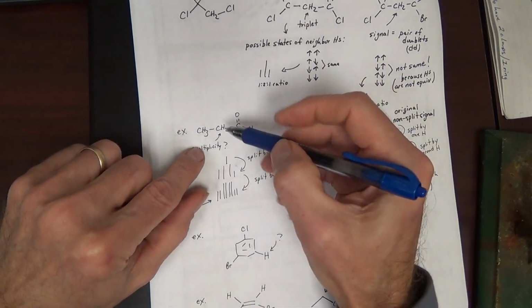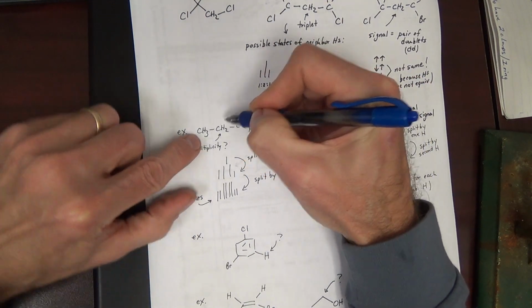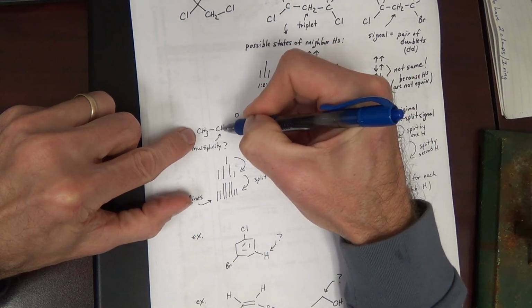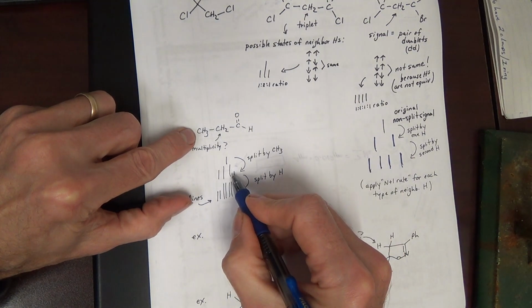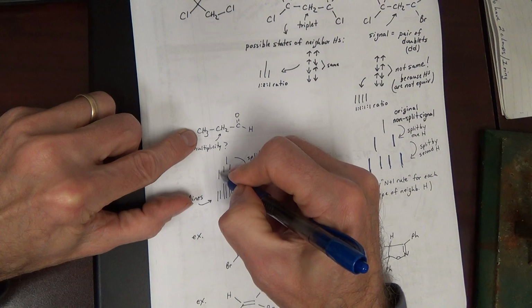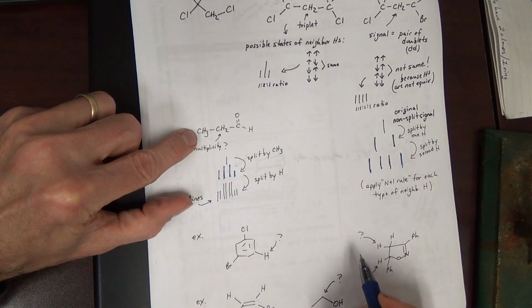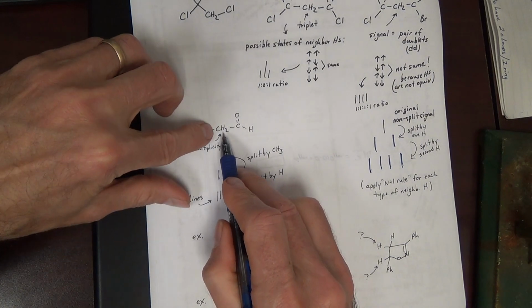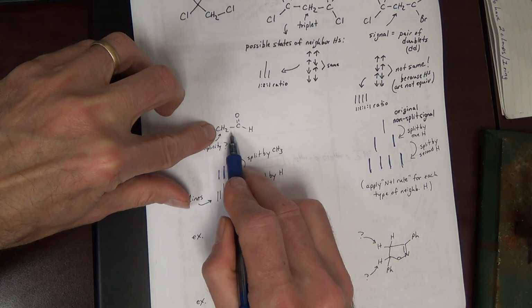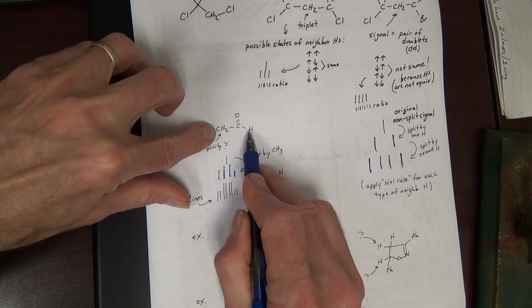Why? We do this splitting separately. First, the CH3 is going to split this into a quartet. n+1 is 4, quartet. So we split the signal into a quartet. Now we come back and we split by this neighbor. 1, 2, it's within 3 sigma bonds.